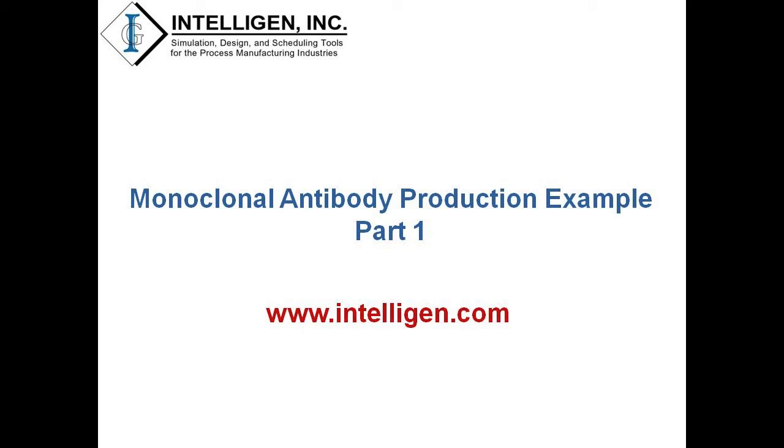Hello everyone, in this video I will guide you through a monoclonal antibody production example which has been created in SuperProDesigner. The example is included in the examples folder of the SuperProDesigner installation directory.